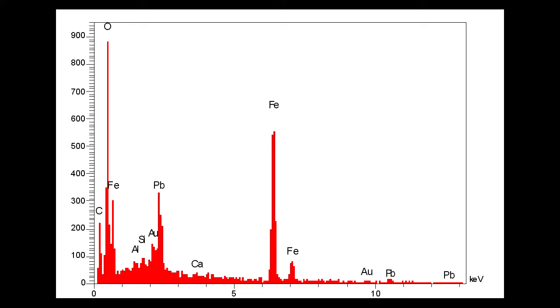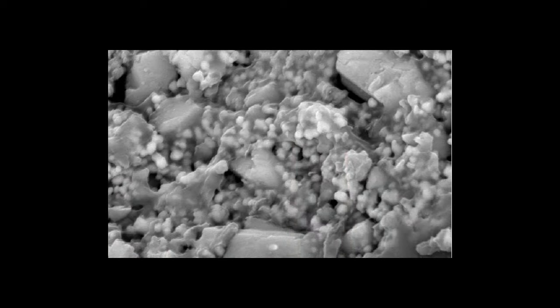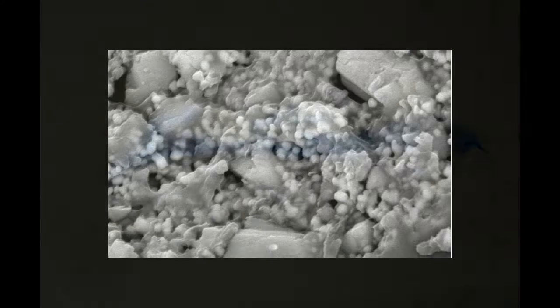Raman spectroscopic analysis is a structural analysis technique that allows us to identify the materials used in an artwork. It can be applied to samples or performed without samples. The technique can therefore be non-destructive if necessary. We use this analysis especially to distinguish between anatase and rutile titanium white, which can imply a dating gap of about 30 years. Raman analysis is also used for more precise research on the possible presence of copper in blues and greens, which, depending on the form in which it is present, would mean different dates of production.